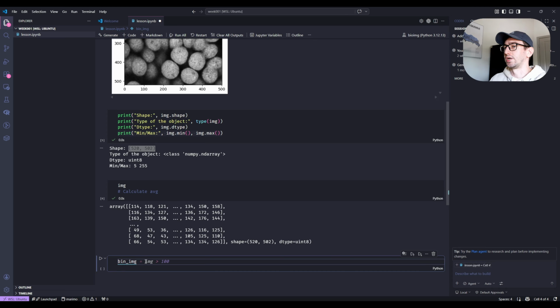And we want to assign an image, which is very hard with the autocomplete. Basically, the idea is that we want to create a binary image. For example, if the value of the original image was higher than the average, we will assign 1, and otherwise we will assign 0. So let's try to execute it, and you need to use plt.show to display the image. So you have time, please work on it.